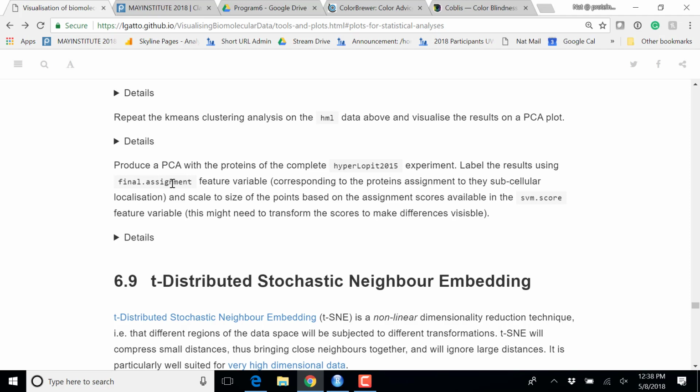Not only using a PCA analysis to visualize this 20-dimensional data set on 2 dimensions, but color the plot based on the result of the class prediction, and use the scores that we get from the class prediction to use larger or smaller points. Use a transformation that we saw at the very beginning to add another level of resolution in your plot. The class plus the size that represents the confidence. Okay, that also combines some of the transformations that we saw before.